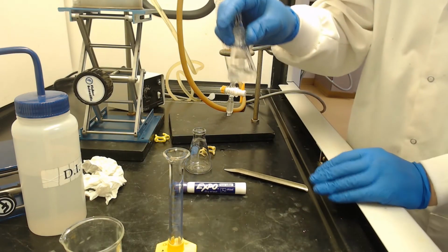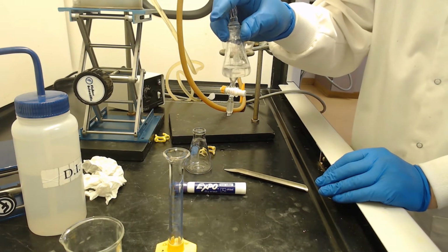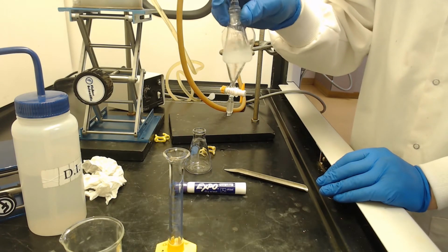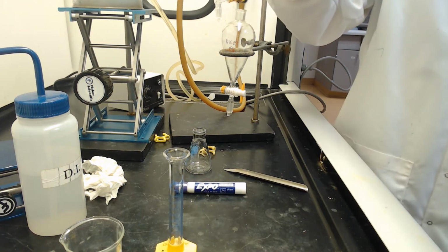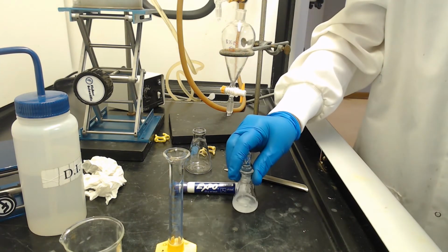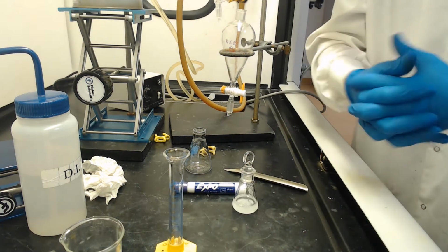We want to give it some time, so we're going to set this aside. I think it says 10 minutes in there, at least 5 to 10 minutes to completely absorb the water. Do you think that's enough? Yep. Okay, good to me. So we're going to let that rest for about 10 minutes, and we'll be right back.